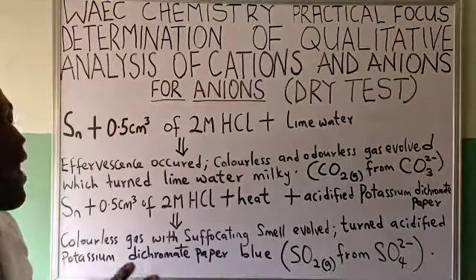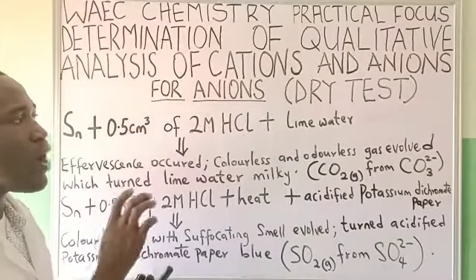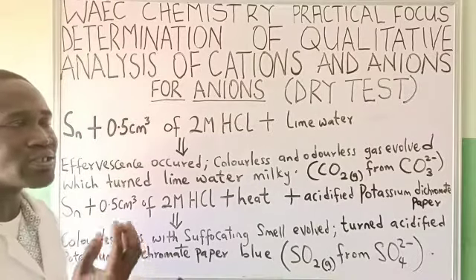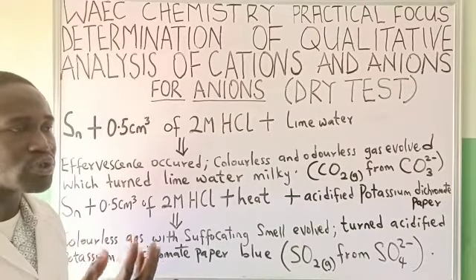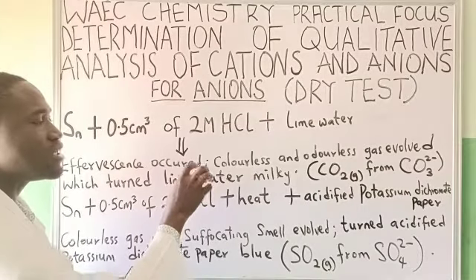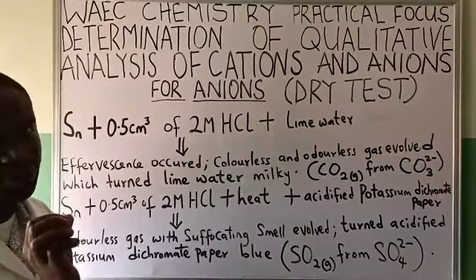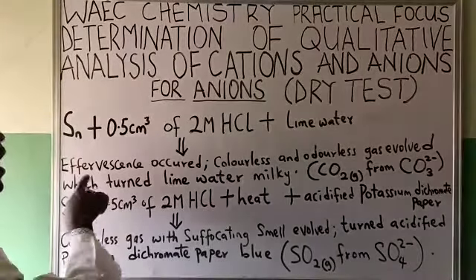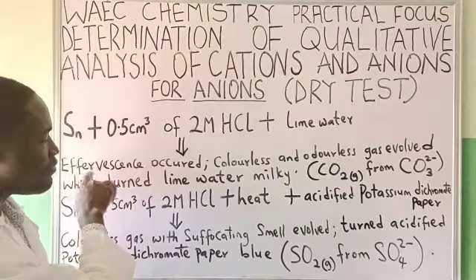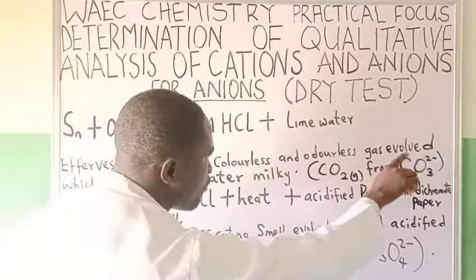Now, my advice to you students is that while making your report on salt analysis, please try as much as possible to see that your report is in past tense or in reported speech. That is, colorless and odorless gas evolved.